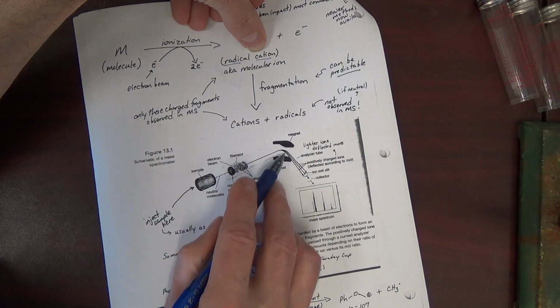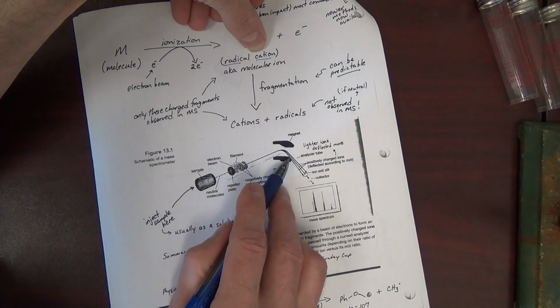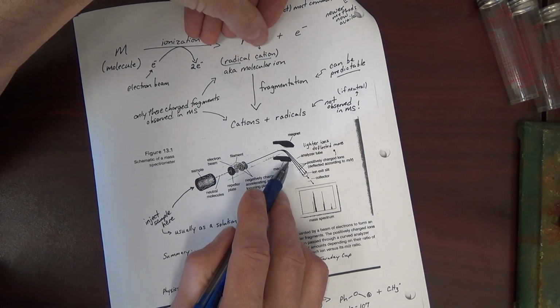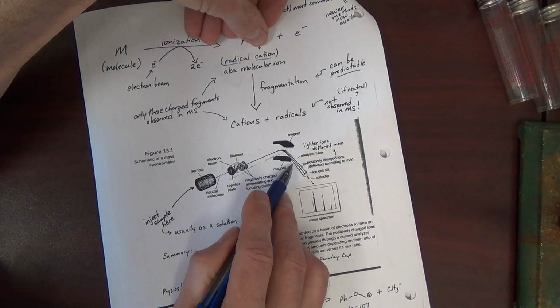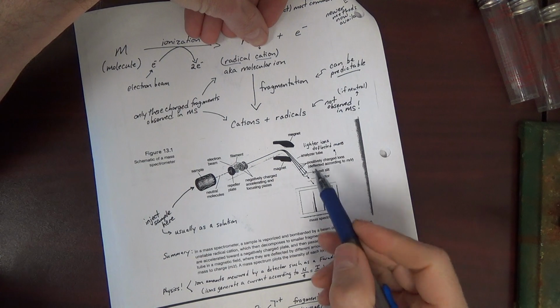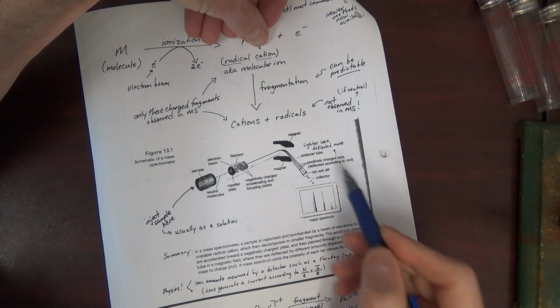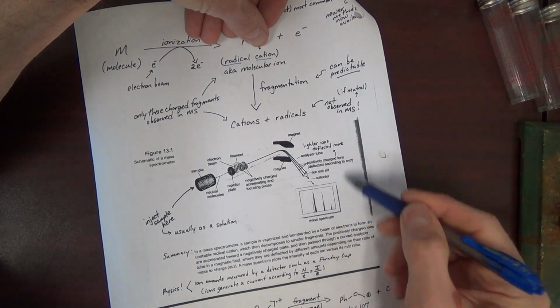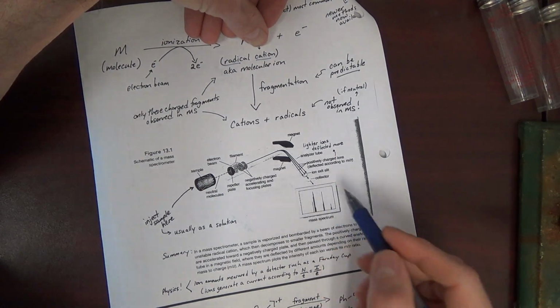And at this point, you're separating your charged particles. You're separating your cations. And once they're separated, they can then hit a detector and register a signal. But the signals will be at different places on your detector, and thus you'll get different signals. Now there's ingenuity built into this. There's calibration.